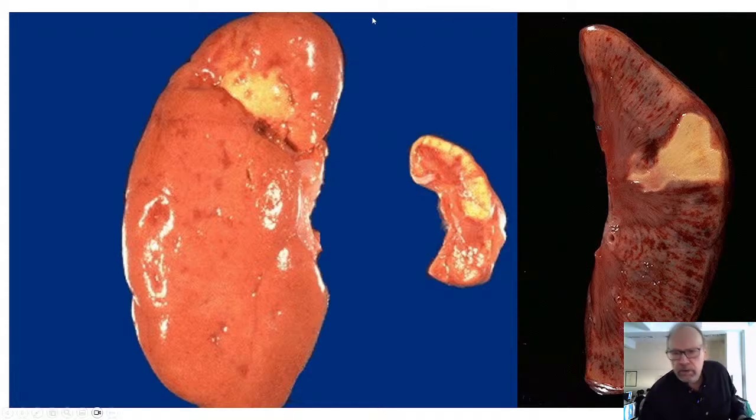Look at this. Look at how atrophic the one kidney has become because there was some sort of congenital stenosis of the relevant renal artery, which was not enough to block the blood supply abruptly so as to cause an infarct.